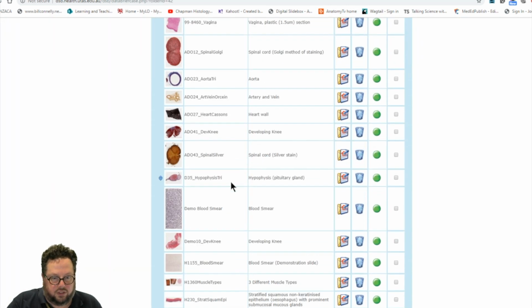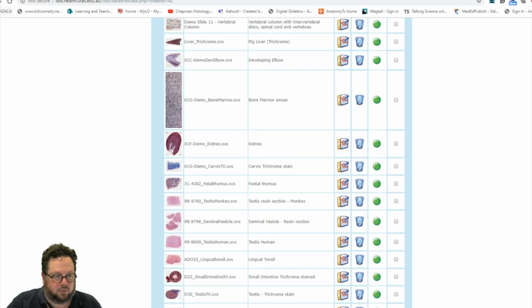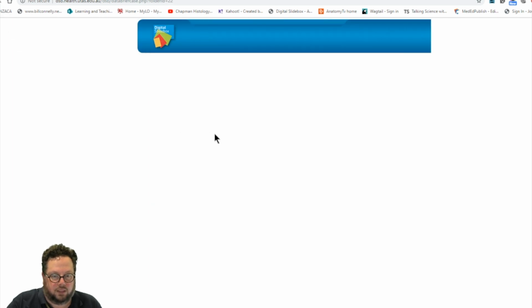So I don't think I've got any, I'll go back one more. The urinary bladder, so we wait for this to load up.